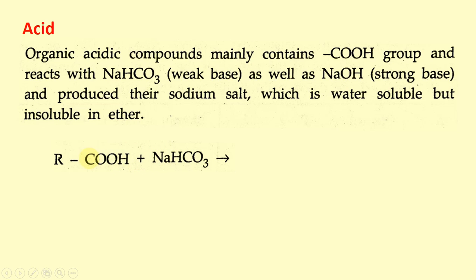The products are RCOONa, which is the sodium salt, and from the remaining HCO3 and H, we get H2O and CO2. So water and carbon dioxide gas are removed, and the sodium salt remains.